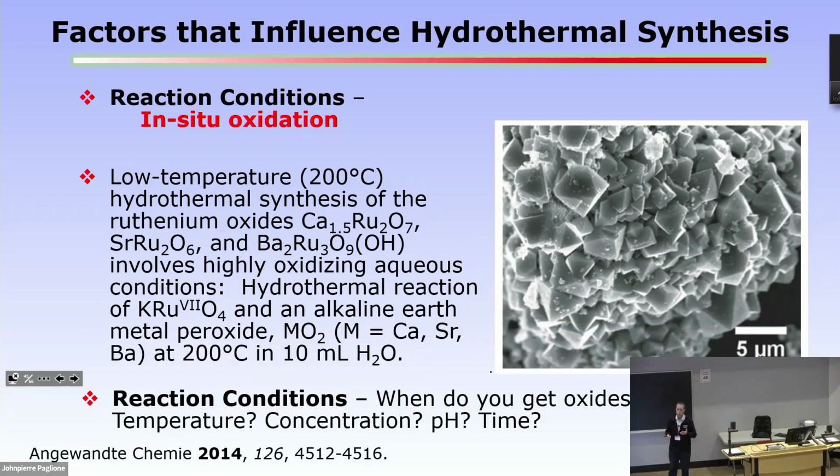There are people who would like more oxidizing conditions. So you can add oxidizing species in it if you're careful. So potassium perruthenate is quite oxidizing, and it can help you maintain oxidation states of certain species or even oxidize them up. Just be aware that things in high oxidation states sometimes get unstable.